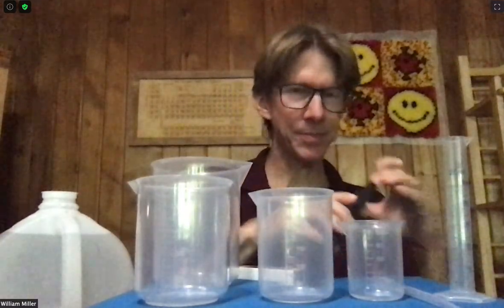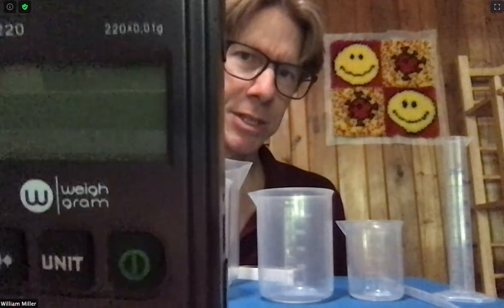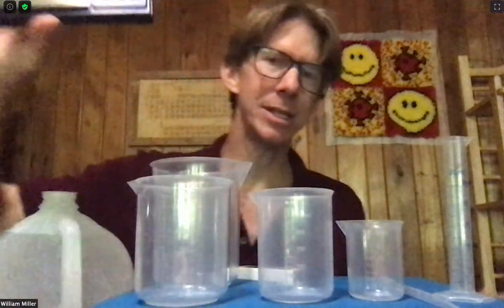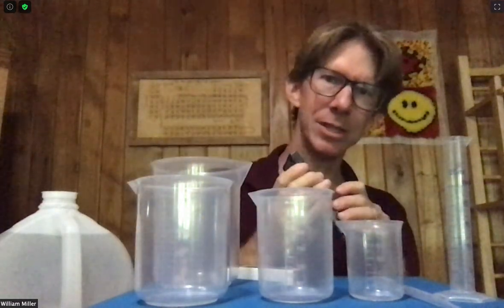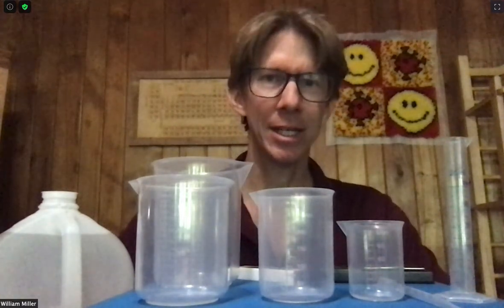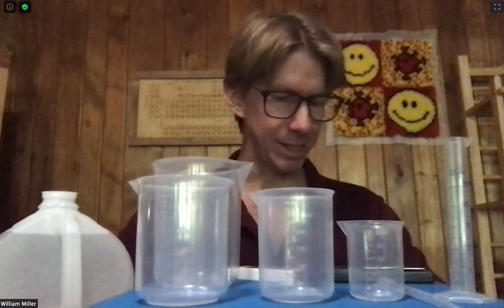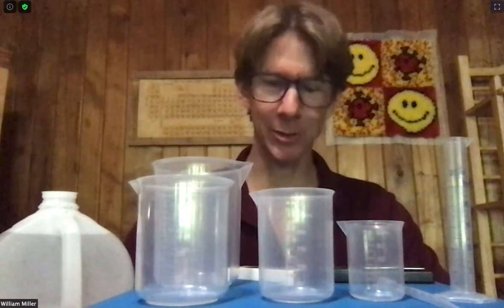You'll need two other things. You'll need a scale that reads to the nearest 0.01 grams — that would be the nearest one hundredth of a gram. The scale I have is called a jeweler's scale and it cost me about $15.99. There are other options too, but I think this is one of the least expensive and yet it has good accuracy from my testing.